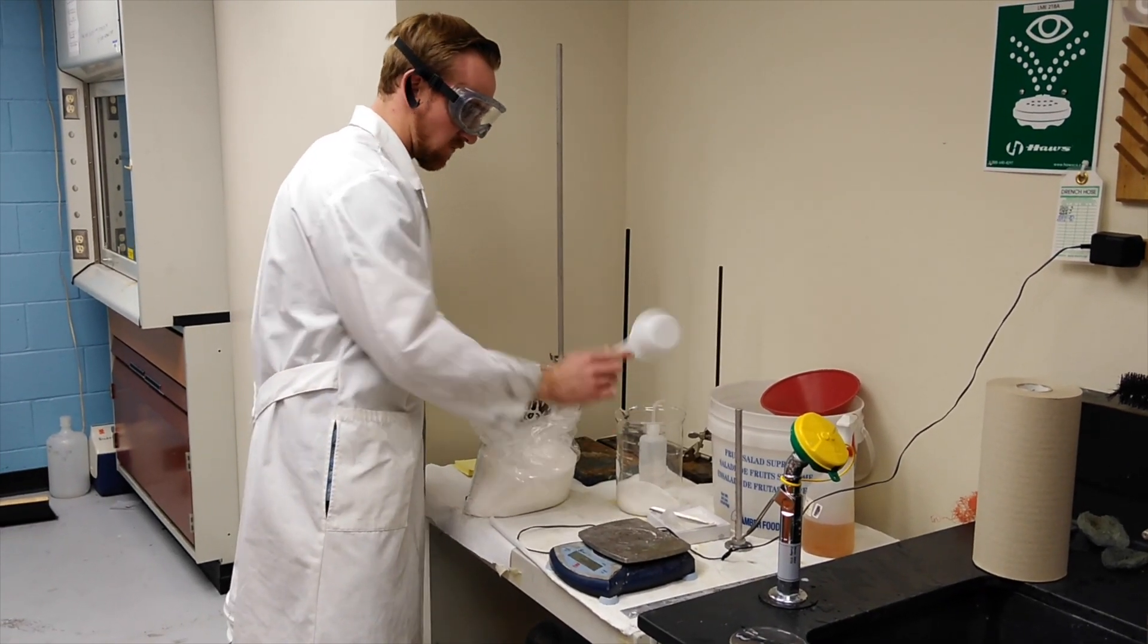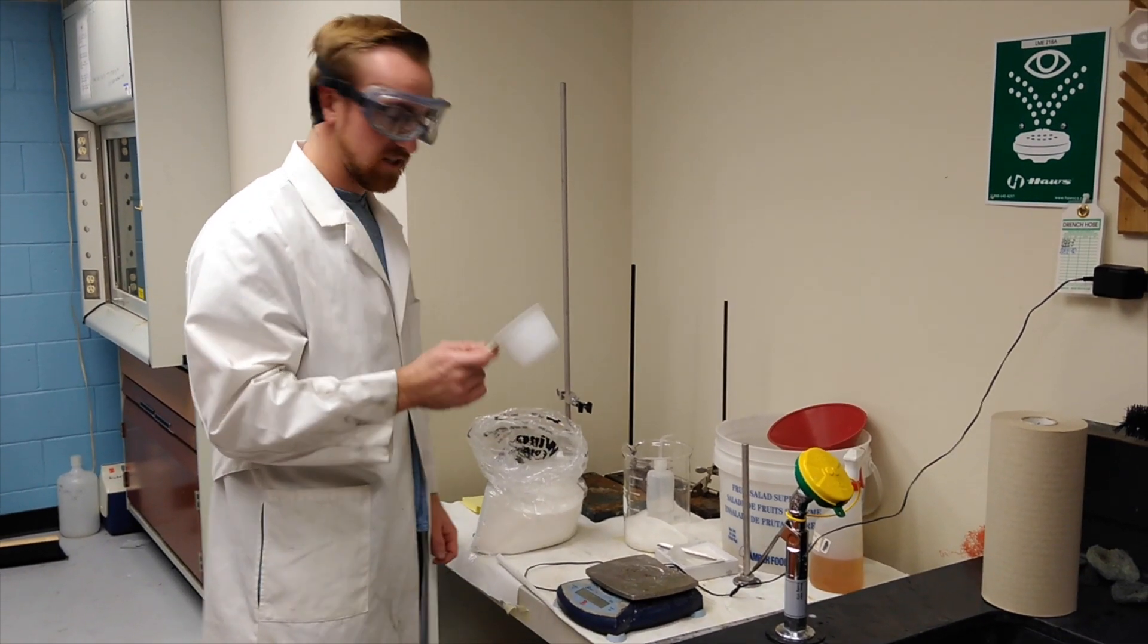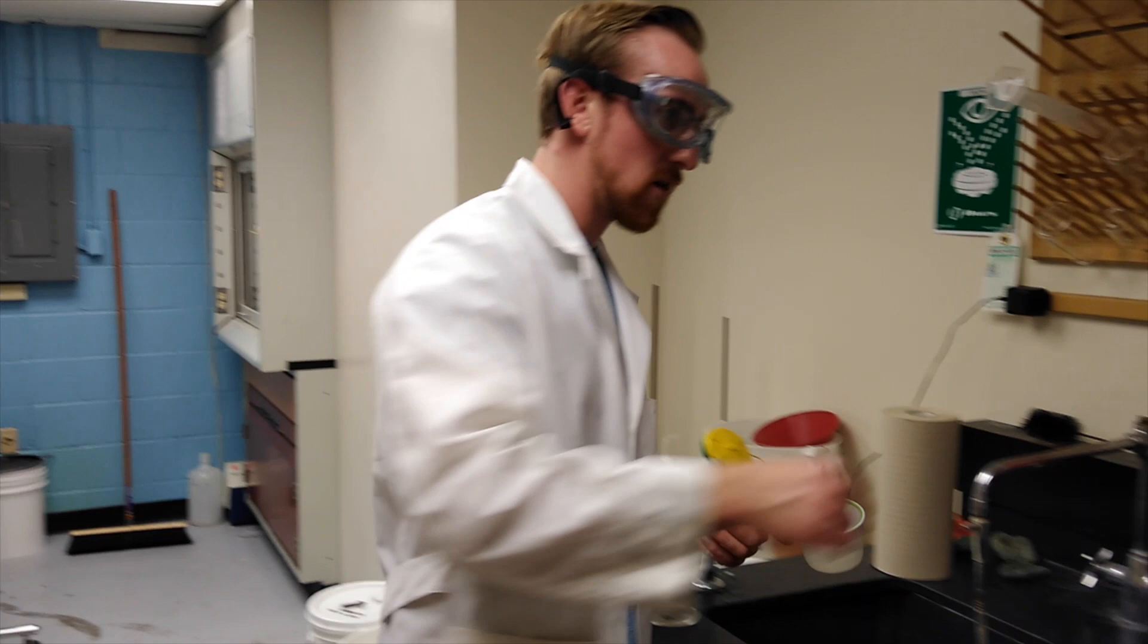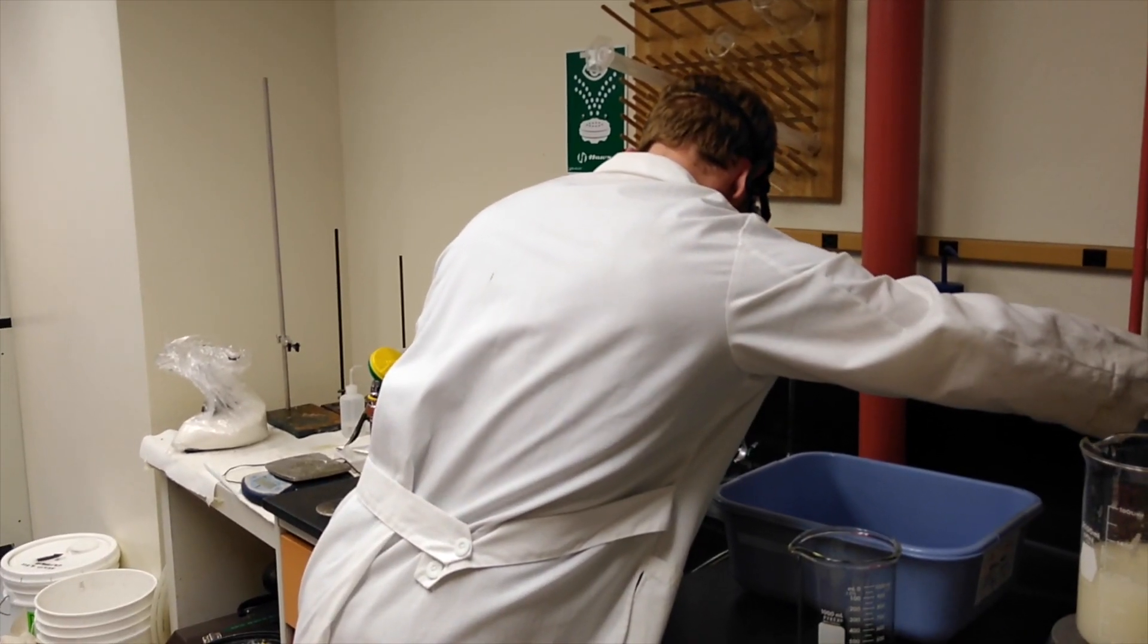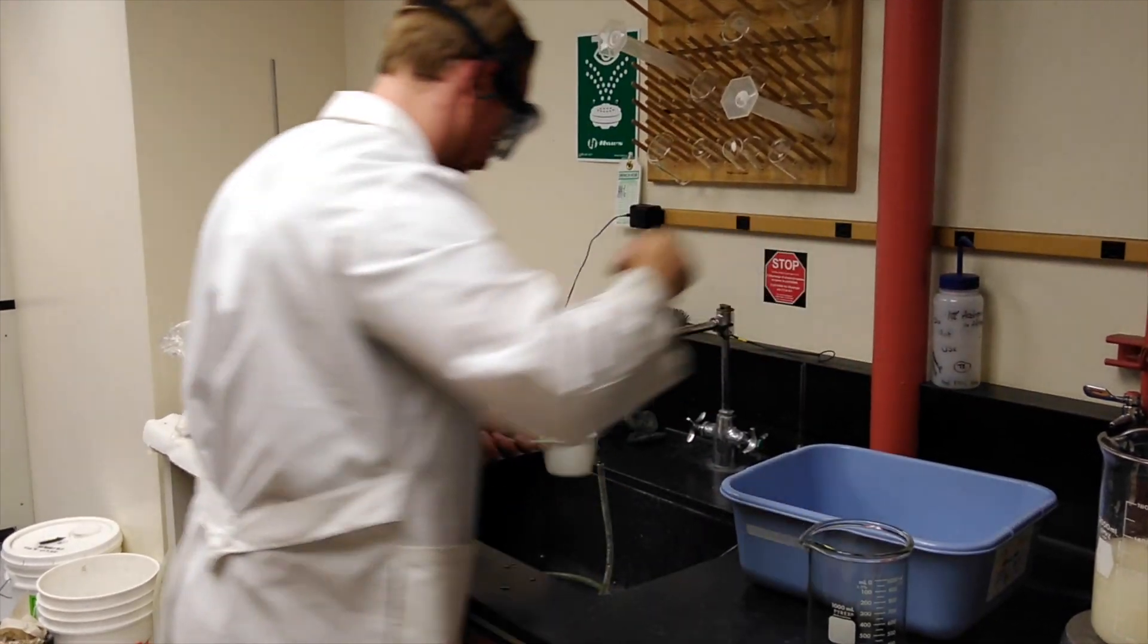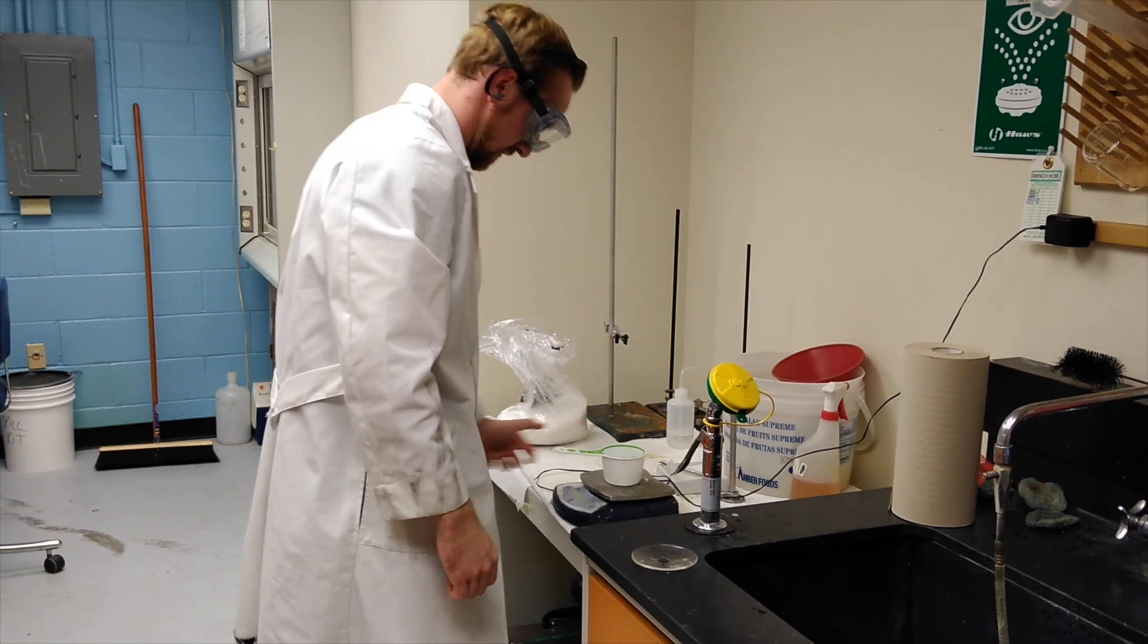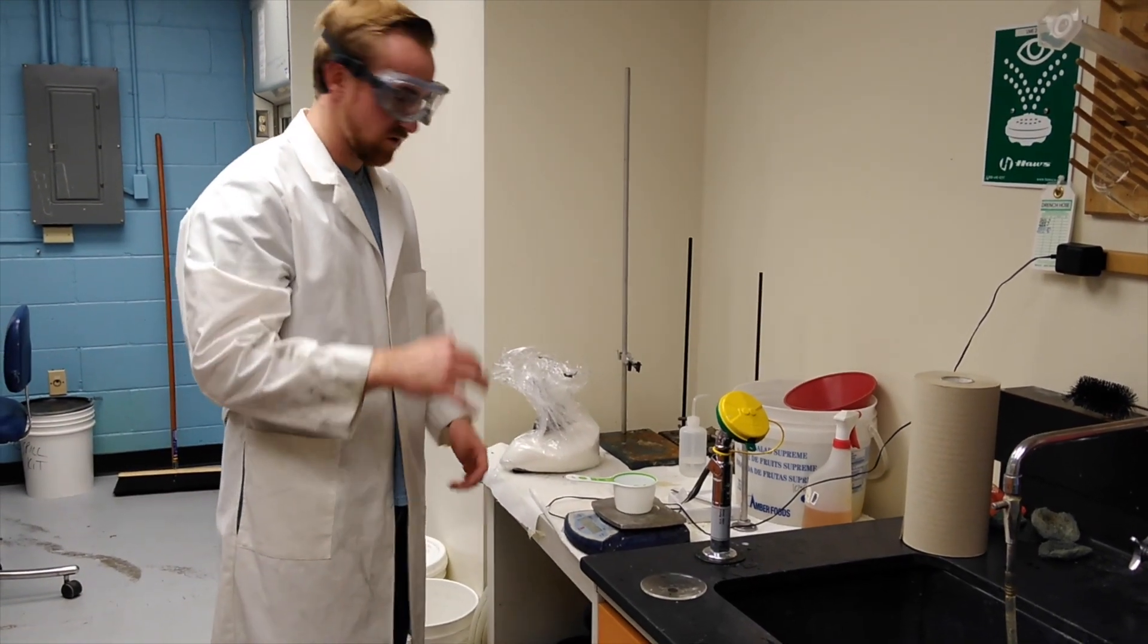For this experiment, we're going to be using five cups of sugar to one cup of water, and we're going to be using DI water. The next step we're going to do is, we're going to take one cup of DI water, and we'll also measure the mass. We will then use this in our sugar solution.